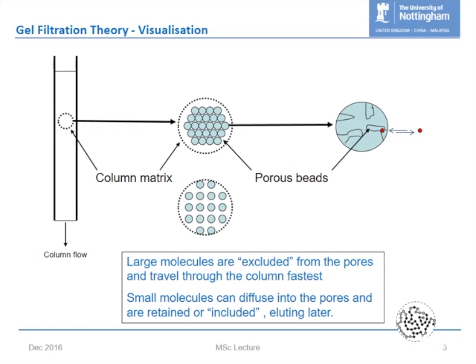Okay, the other thing that I would like to say about this is that if we have hexagonally close packed spheres, which is what we're heading for, basically the smaller the particle, the smaller the channel between them that the molecules are flowing through, and the greater the interaction with the particle itself.